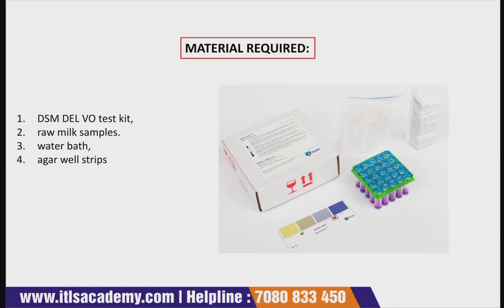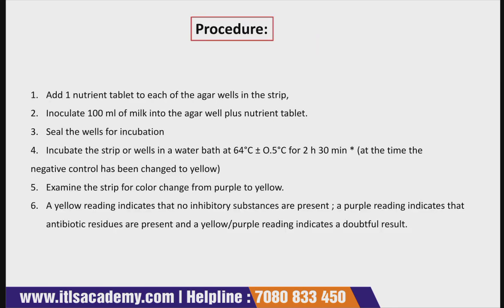Now for this particular test, we are going to see what materials are required. The first material required is the DSM DELVO test kit. The kit looks like this, as you can see in the image. Then you need a raw milk sample, a water bath, and an agar well strip.